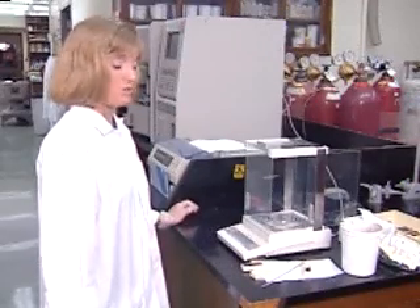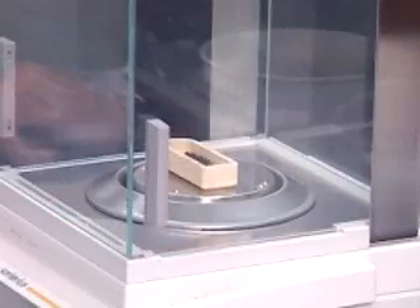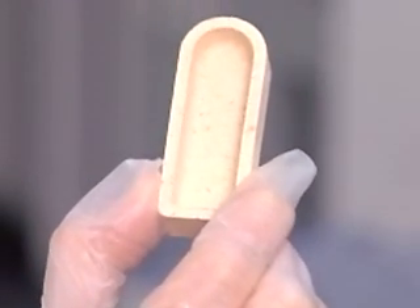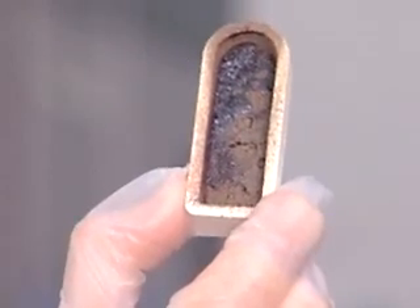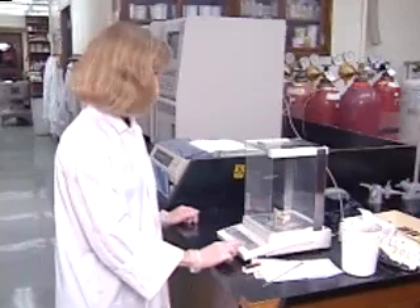What we do is we take a sample and put it in a boat and place it into the balance. This is what an empty ceramic boat looks like. We can reuse the boats even though they look like this, because all the carbon and nitrogen has been burnt off. With the press of a button, the weight has now been transferred to the analyzer.